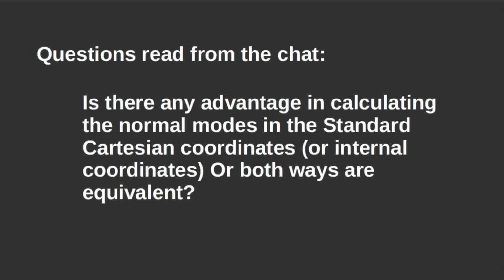I would say you should better try these methods with structures that come from the data, which means not atomic structures, but reconstructions or subtomogram averages. In this case you are really using Hessian diagonalization with the Cartesian method, so there are no internal coordinates.